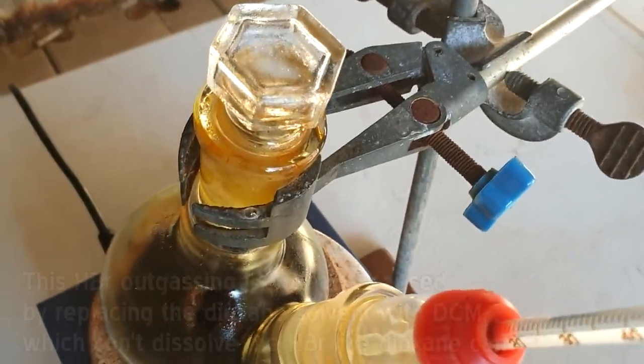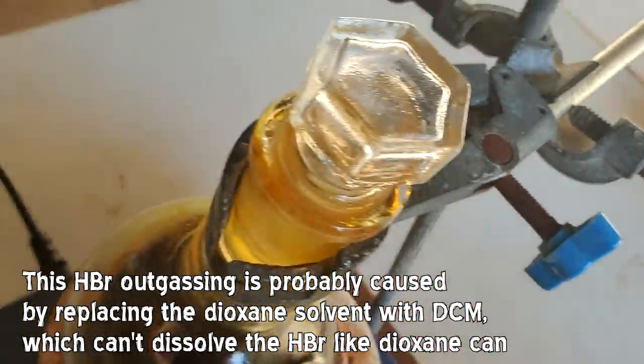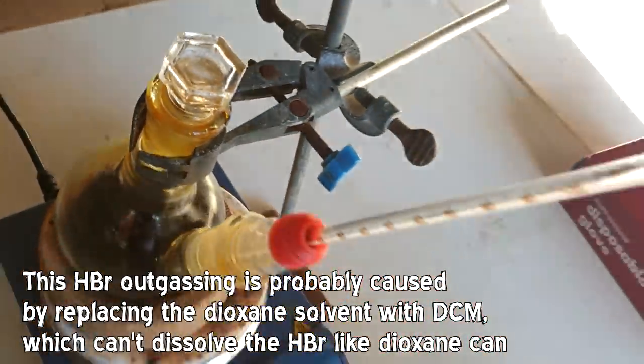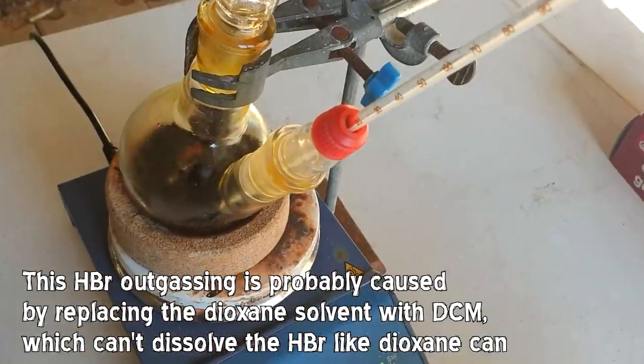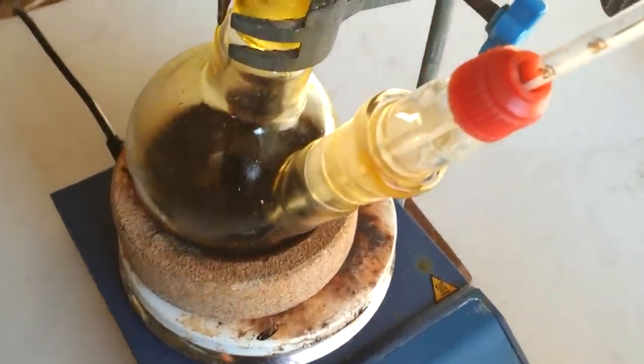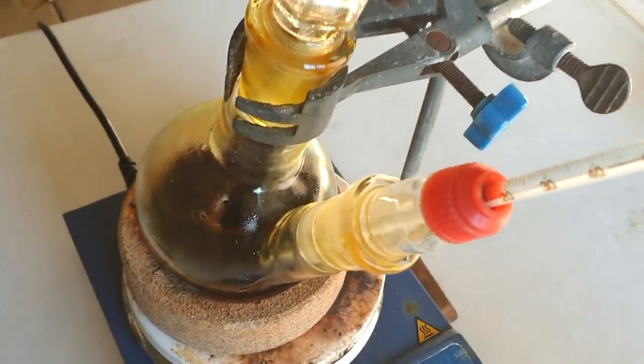Obviously, the gas needs to escape, but I can't let any water get in, and the hydrobromic acid is so hygroscopic, you can see some water collecting around that neck there, because that acid vapor really pulls water from the air very quickly. So, we may have stuffed everything up. It's looking very tarry, but maybe it's meant to look like that, is what I mean.